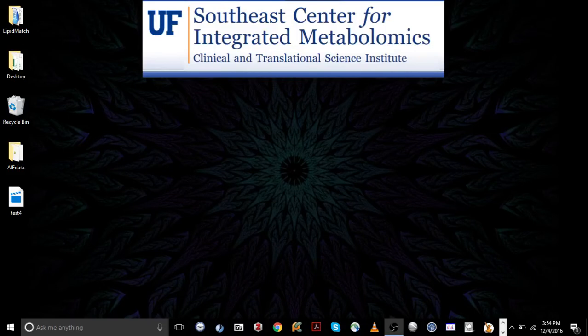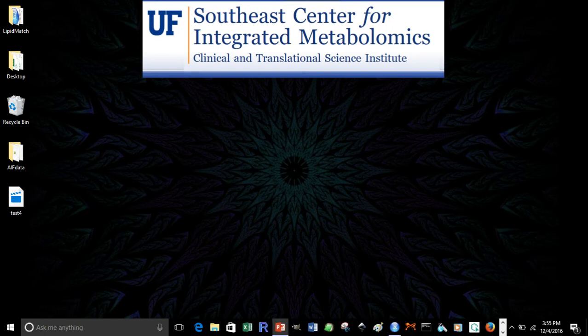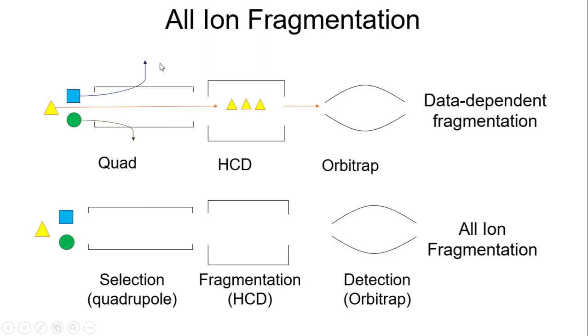Hello, this is Jeremy Comel and welcome to LipidMatch tutorial part 7. In this tutorial, we're going to discuss all-ion fragmentation.